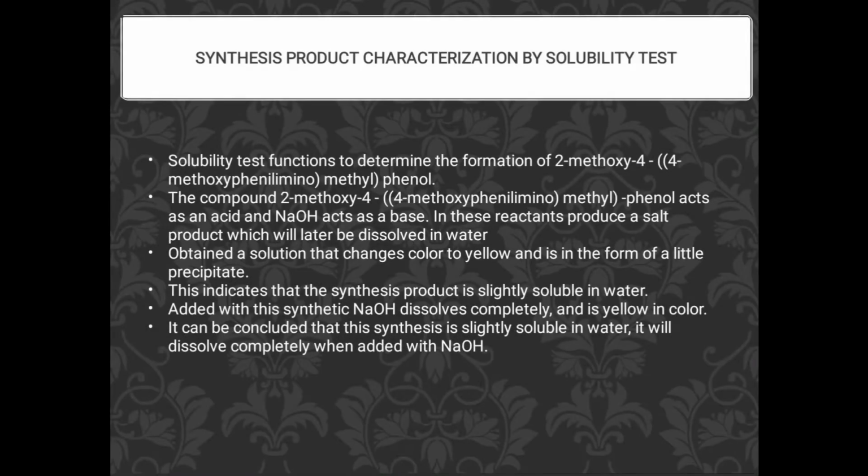My name is Safira Arila. I will explain about synthesis product characterization by solubility test. The solubility test functions to determine the formation of 2-methoxy-4-((p-methoxyphenylimino)methyl)phenol. The compound 2-methoxy-4-((p-methoxyphenylimino)methyl)phenol acts as an acid and NaOH acts as a base. This reaction produces a salt product which will later be dissolved in water. We obtained a solution that changes color to yellow with a little precipitate. This indicates that the synthesis product is slightly soluble in water.